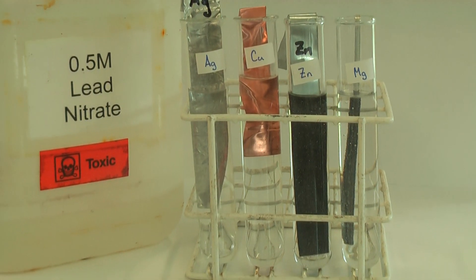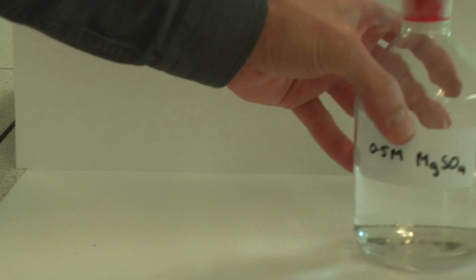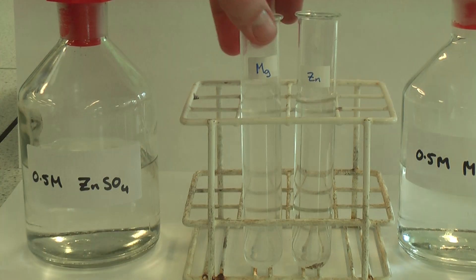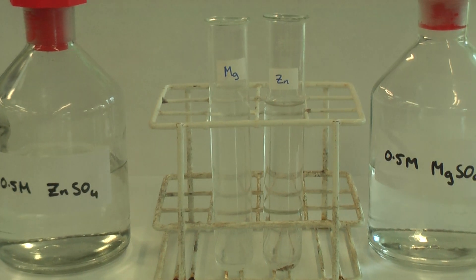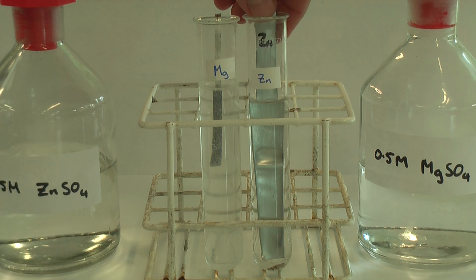Now let's change the solutions. I've got magnesium sulfate and zinc sulfate in two test tubes. The one on the left is zinc sulfate and the one on the right is magnesium sulfate. I'm going to put magnesium into the zinc sulfate solution and zinc into the magnesium sulfate solution.